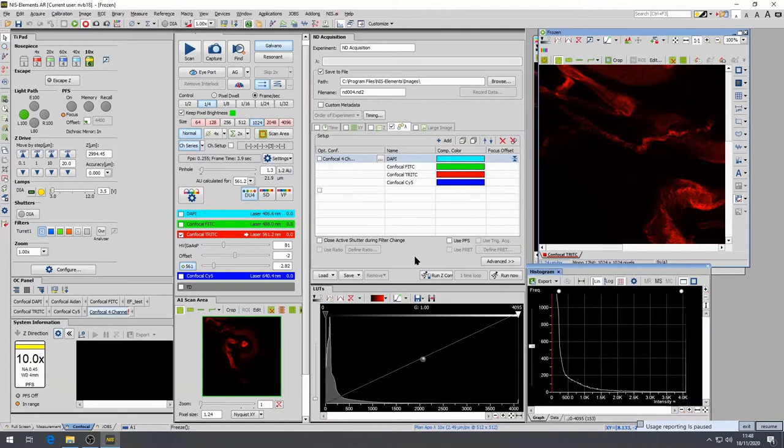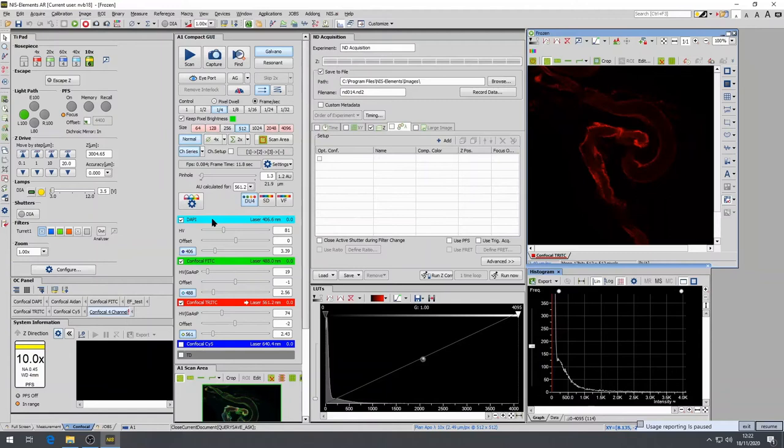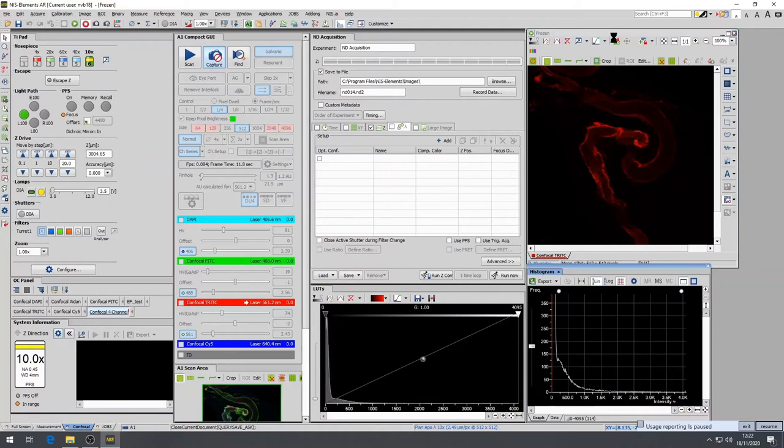Once you have selected all channels you wish to visualize, to stop the scan, simply press the scan button a second time. Press the capture button if a single acquisition is desired. This will generate an independent acquisition window.